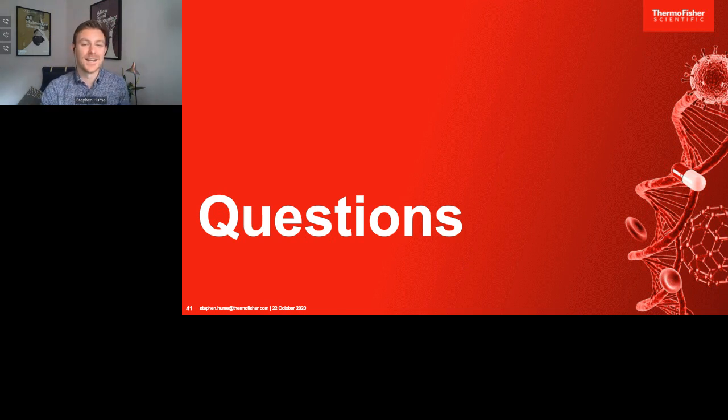Let's keep going with a question for Dr. Luckmeyer again. This is one from Carl. Did you use powder or liquid media? If powder, was dissolving the media an issue?